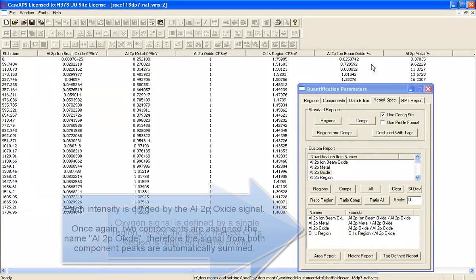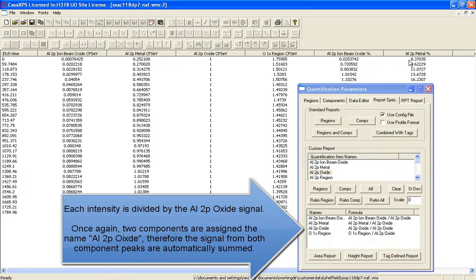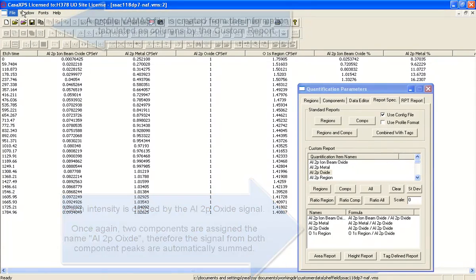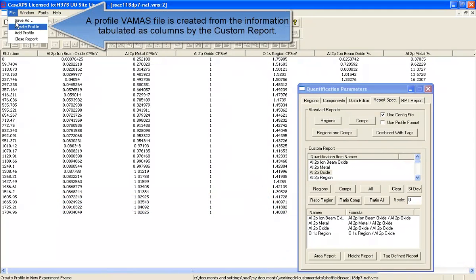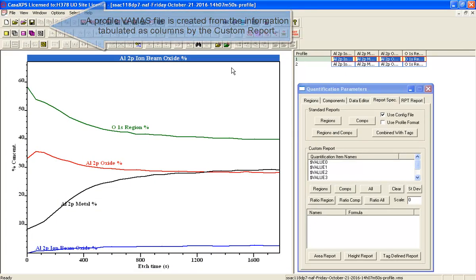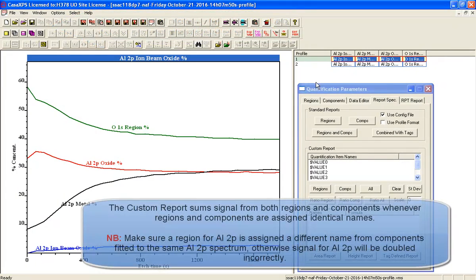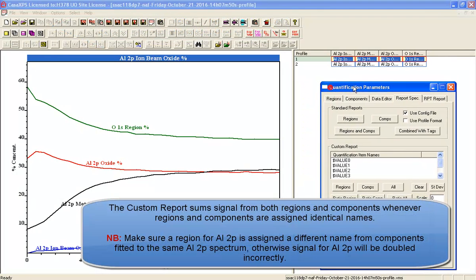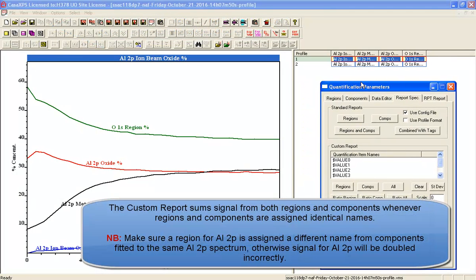So having created a report, we can now generate a profile using the File menu. These profiles have been constructed, in the case of the Oxygen, from a region.